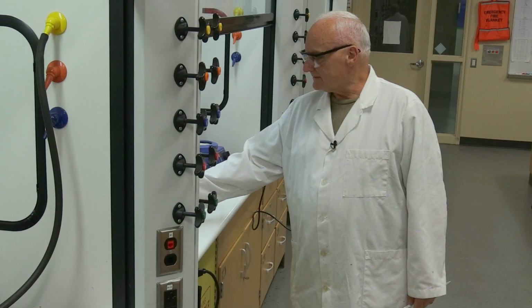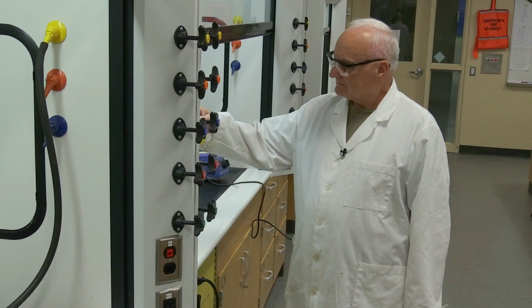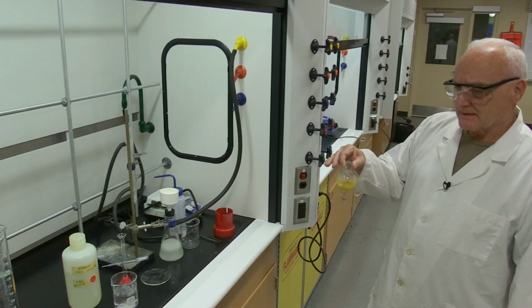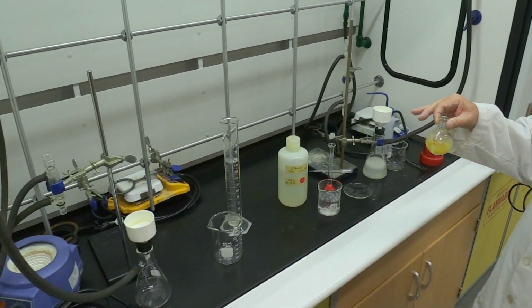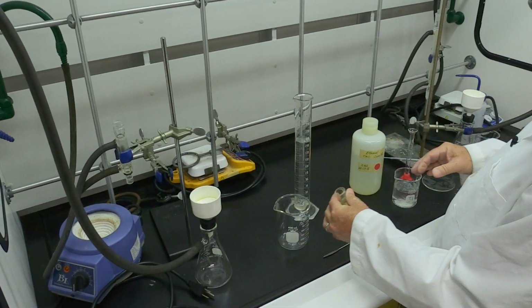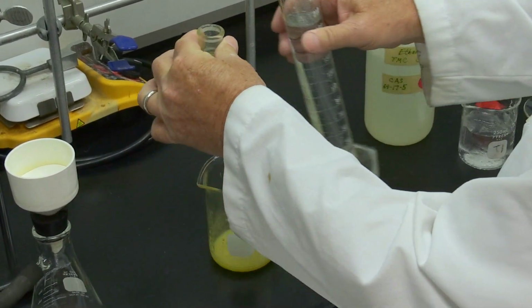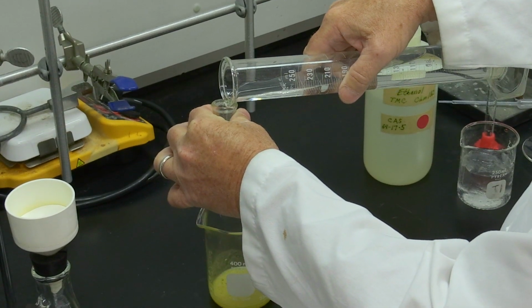Okay, so we've let the sample cool for a while. Part A, the 9-benzyl fluorene. We're going to transfer it to another beaker and prepare it to filter it with suction. Add a little bit of water to help us transfer it.